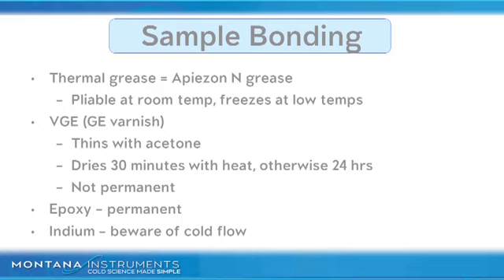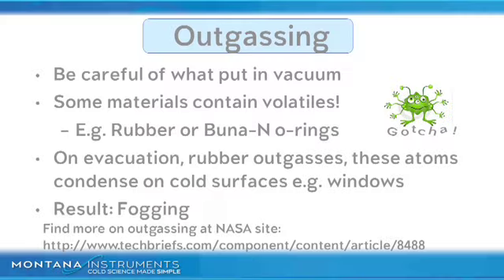The problem is that it tends to be a bit thick and you've got to be aware of cold flow. So if you've got a bolted joint or some pressure on the joint and you've got indium in the joint, then if you cool down, the joint will increase in force and the indium will flow because it is actually soft compared to the joint and materials holding the joint. Then when you warm up, the indium can leave a little gap or have reduced force. Then the next time you cool down, you won't have as good of a conductance. In that case, just retighten the bolts.